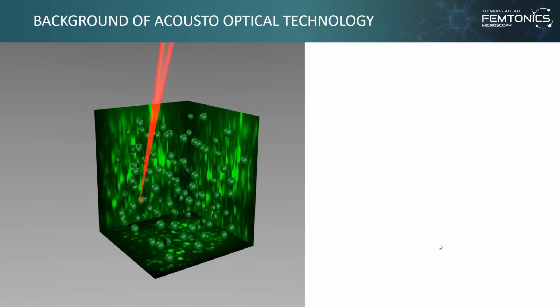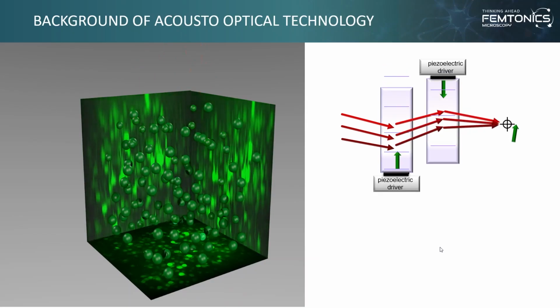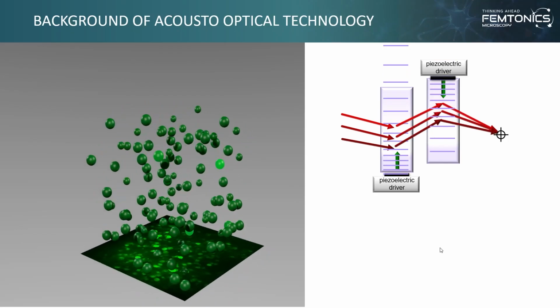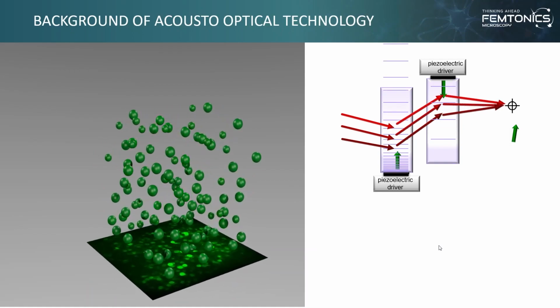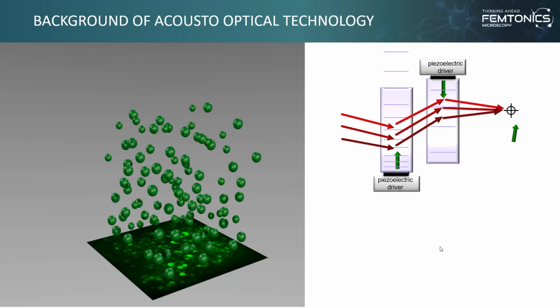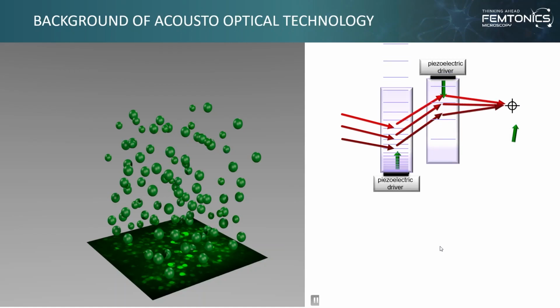As it was mentioned in the lecture about voltage-sensitive dyes, the main advantage of the acousto-optical technology is the flexibility that the position of the focal point can be controlled within a 10 to 30 microsecond temporal precision without any mechanical constraint. The technical background is that we have acousto-optical deflectors, which consist of crystals bonded to an electric transducer emitting ultrasound waves to the crystal when driven by a sine wave. Changing the frequency of the sinusoidal voltage changes the deflection angle of the light falling through the aperture. With this technology, a very fast random 3D access can be achieved, making it possible to scan arbitrary ROIs.